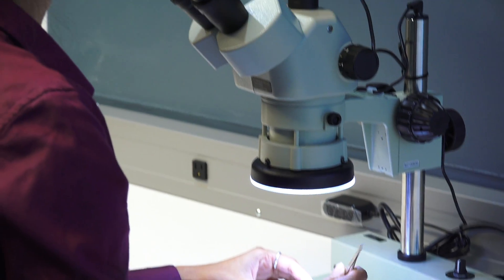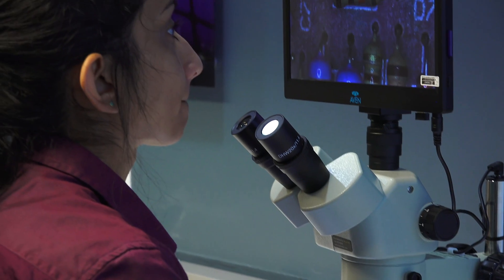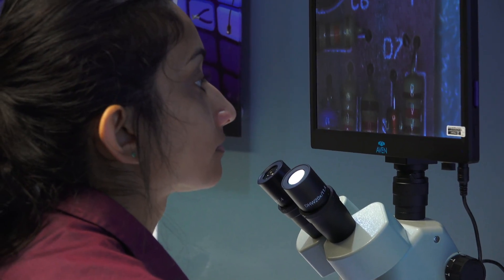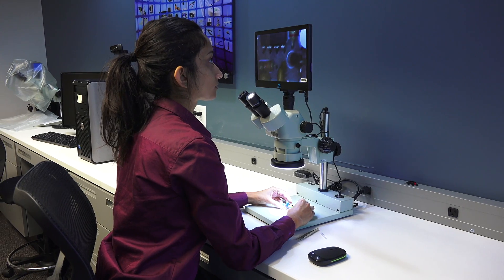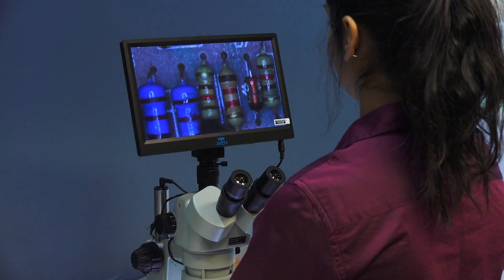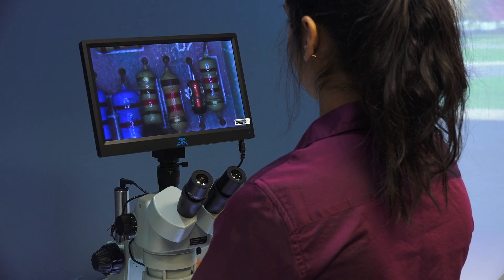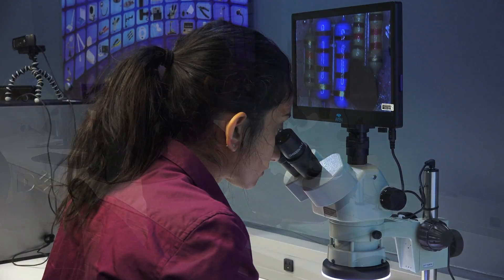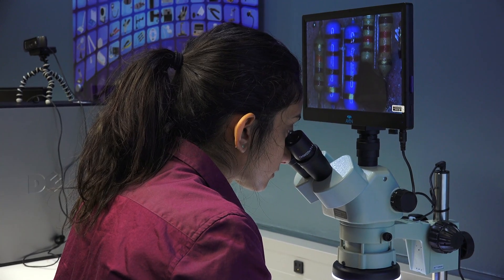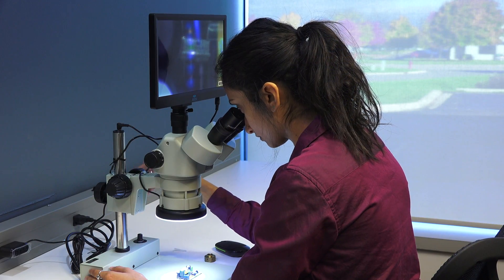When attached to a trinocular microscope, MightyCam Eidos aids in alleviating common physical stresses like eye strain and neck fatigue, often associated with frequent microscope use. The monitor display sits directly above the eyepieces allowing inspectors to comfortably view objects while using the existing microscope objective, all while freeing up much-needed bench space.